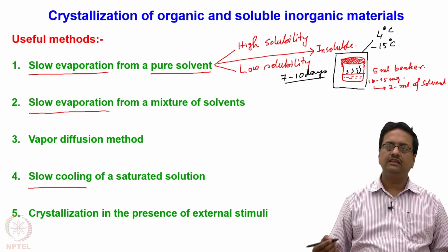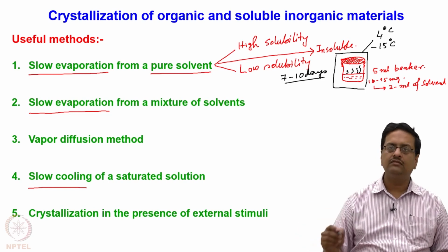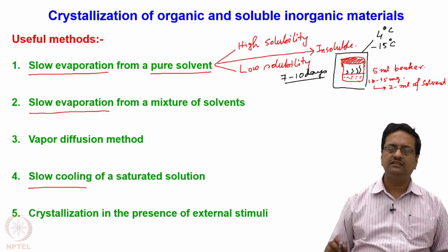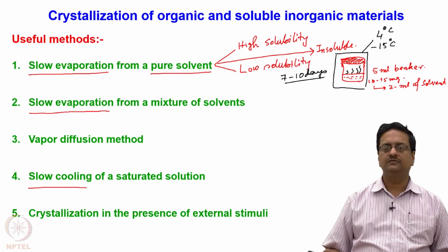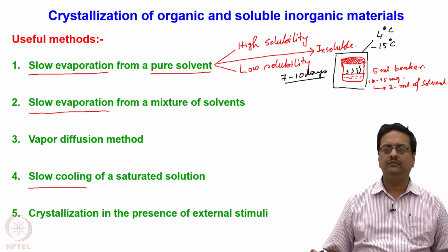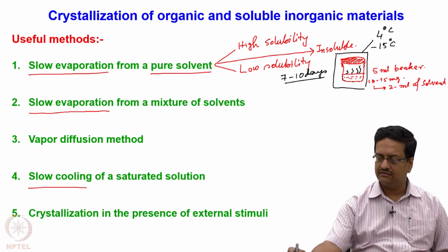So on doing this process, with slow evaporation of the solvent, at a given point of time the solution reaches saturation with the compound, and then the compound slowly comes out of the solvent, the nuclei start to grow, and at the end of the day, maybe after a week or so, we end up getting crystals of the compound sticking on the walls.